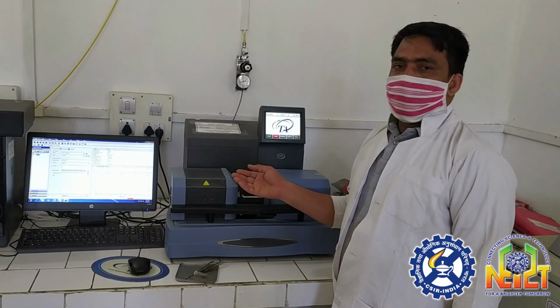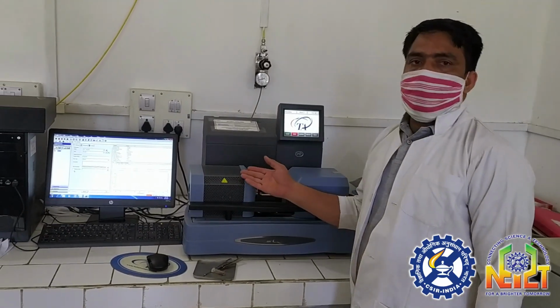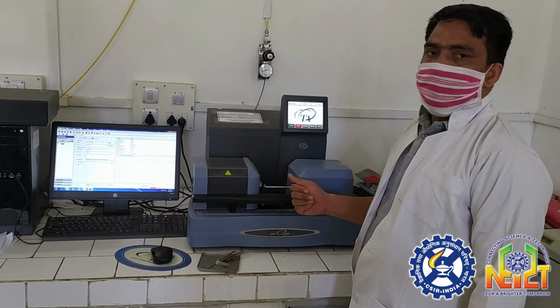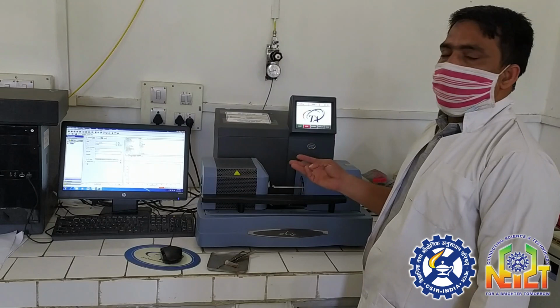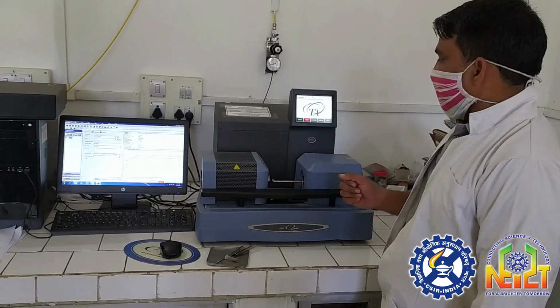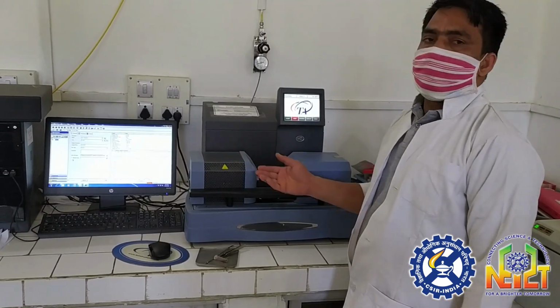This is the thermogravimetric analysis instrument, TGA. In this instrument, the sample is heated under a given environment such as nitrogen, oxygen, air, helium, and argon. Today, I want to show how to operate this machine.